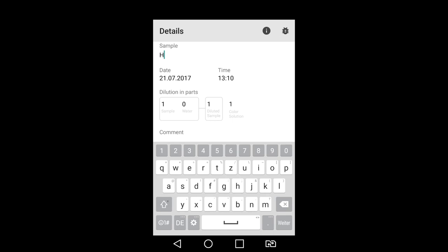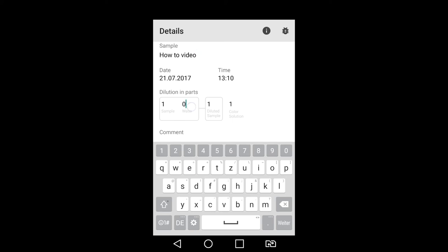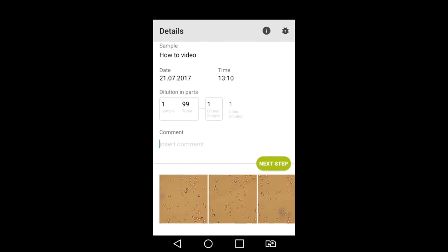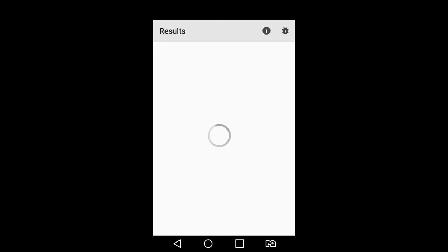In the sample field, enter the name of your sample. Date and time are automatically entered. Enter 1 part sample and 99 parts water for the dilution and 1 to 1 for the sample's mix ratio of coloring agent. Include whatever you would like in the comment section. We recommend where the sample was taken from, the type of yeast and the generation of the yeast. Click next to view your results.